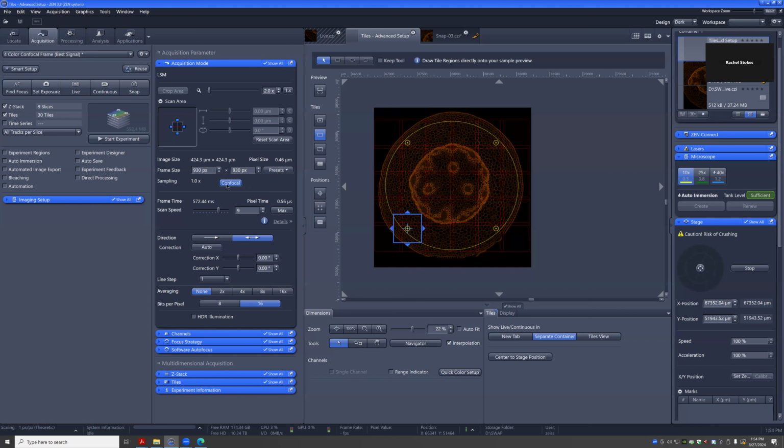So this is why this confocal button is nice, because when you hit that confocal button, it automatically calculates the maximum amount of pixels I can resolve. So resolution wise, this is my peak on this objective in this particular mode with this particular laser wavelength. You'll see that when we get the area scan, and we'll do that next.